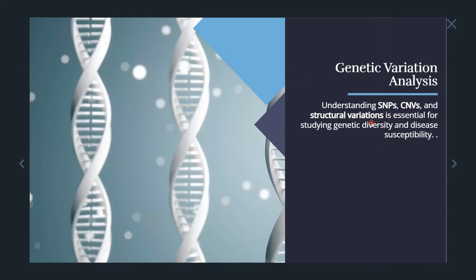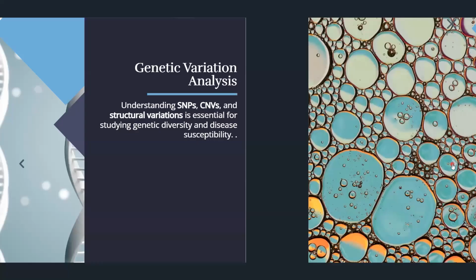If you identify those mutations against the reference genome with respect to your target of interest, ultimately, guys, you are uncovering information on genetic diversity with respect to disease susceptibility. This information will help you explore certain information in the genomic context.